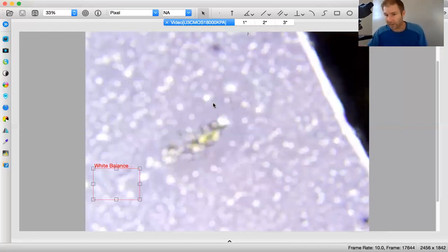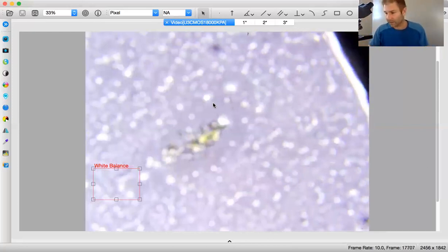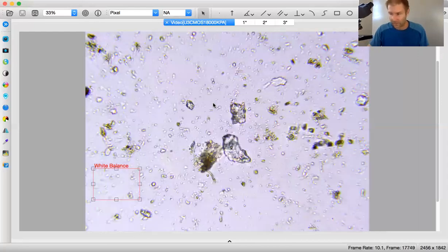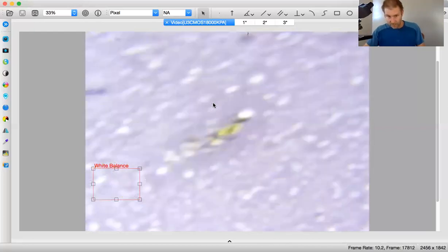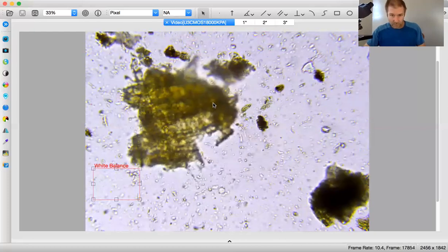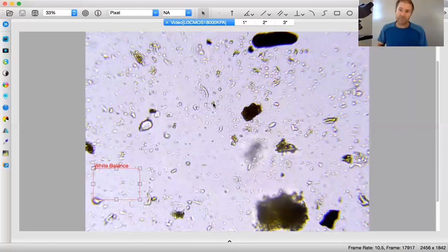I was very, very comfortable with this one. My best so far, and damn it. It's all dry. It's all dry from now on out. This is that same row, but it's moving too quick. It's drying up. Damn.